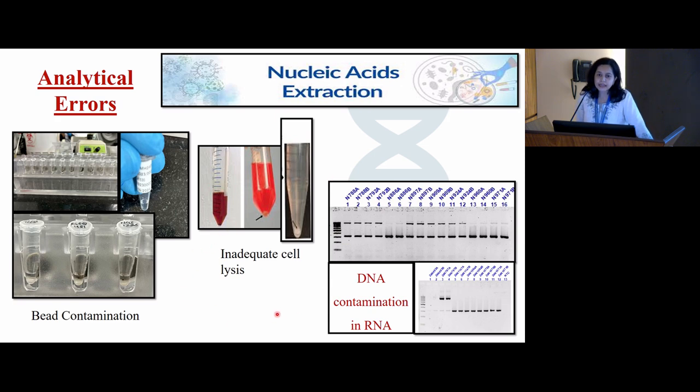In that case, your buffer and pH should be adequate. You can see here there is a WBC pellet, but the red cell lysis buffer is also there, so you cannot accept this. The pellet should be very proper after lysis. Hemolyzed samples will not give you proper results.